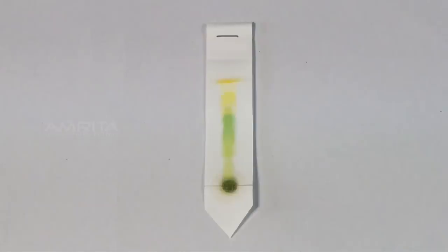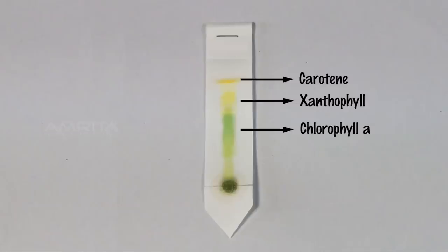Result: The topmost orange-yellow band of pigments in the separation corresponds to carotene. The yellowish band appearing below it indicates the xanthophylls. The third from the above dark green band represents chlorophyll A. The lowermost yellowish green band is that of chlorophyll B.